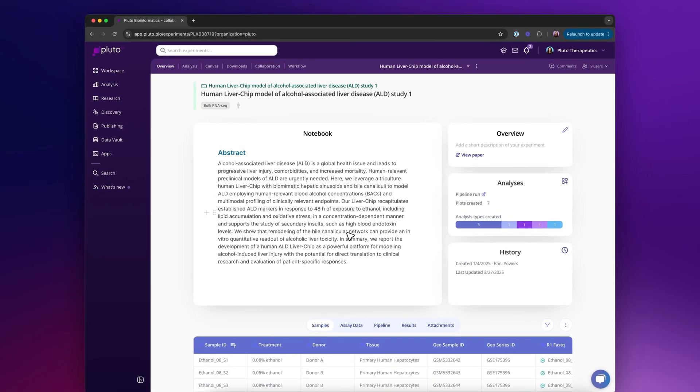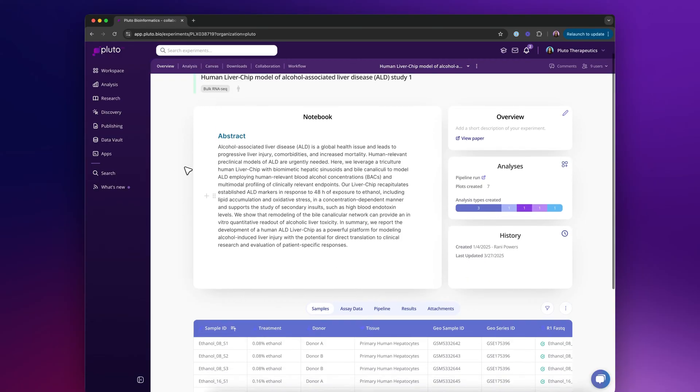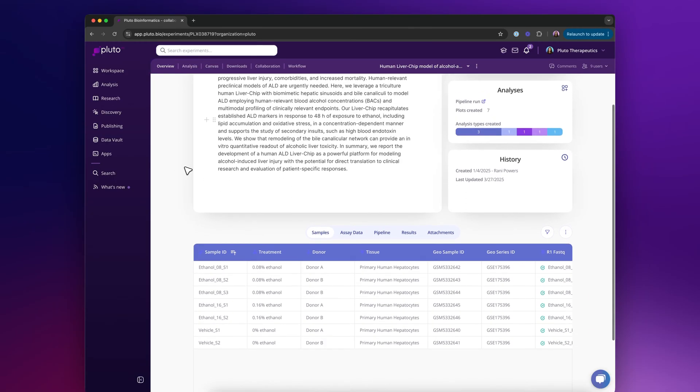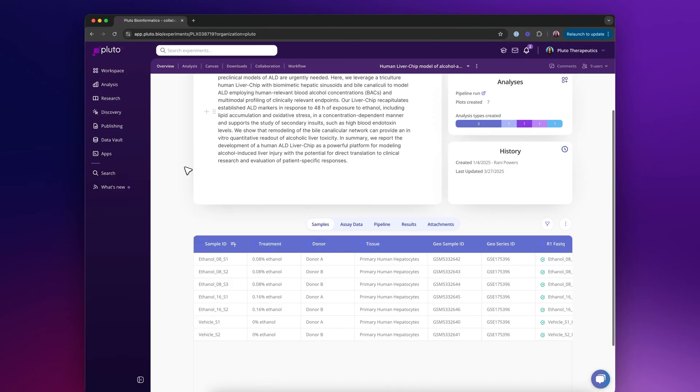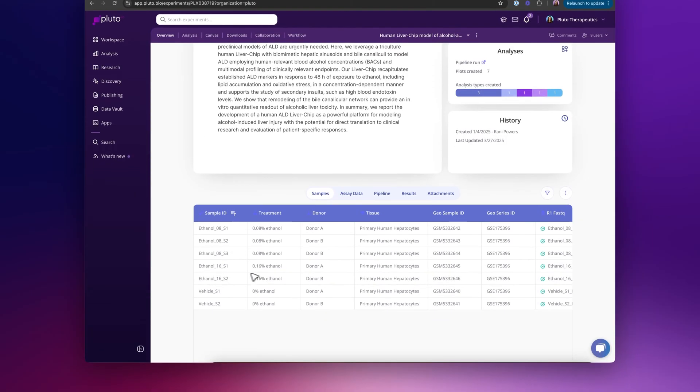Let's take an in-depth look at the analysis canvas in Pluto. For this experiment, I'm looking at a bulk RNA-seq experiment which had a couple of samples that are described in this table below.